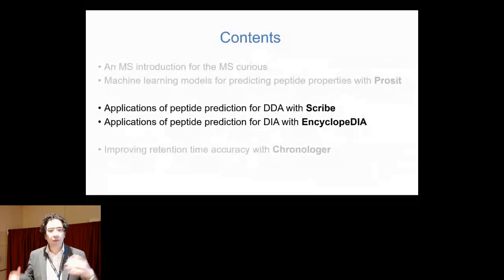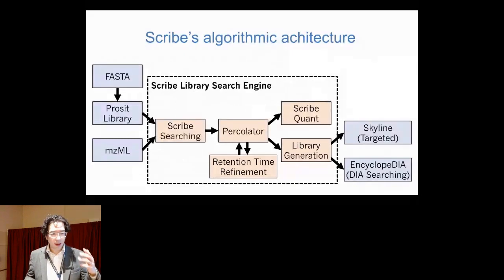So again, the biggest problem for us is trying to take spectra and match them to peptides, and ascribe what the actual sequence of that peptide was based off of the spectrum that's present. So we'll take spectral raw files, and simultaneously we'll take FASTA databases of proteins that we've cataloged, either using DNA or RNA-seq on new samples, or on just analyzing well-known canonical genomes.